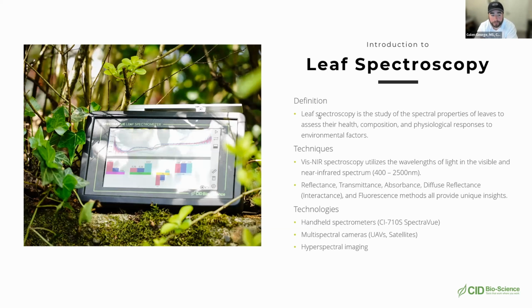If you are interested in absorbance or transmittance, then the thicker the leaf, the more difficult it is for the light to get through, because NIR light is low energy. So the penetration, even though shortwave near infrared is the most penetrative of all the NIR wavelengths, is still limited in how far it can penetrate. So it depends, I guess, on exactly what you're trying to measure. But for reflectance, I would say sure. Anything waxy is likely to present a little bit of interference, but other than that, you should be fine to use it. Thank you for that question, Kendra.